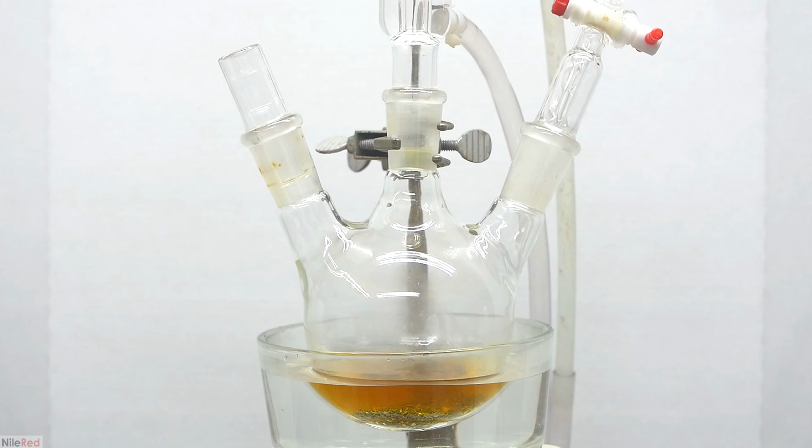Before we add any 1-bromopentane, I place the flask over a hot water bath just to heat things up. Diethyl ether has a very low boiling point, so this hot water bath causes a little bit to boil, and you can see some of the bubbles coming off. The Grignard reaction can be kind of a pain to start, especially at room temperature, so by heating things up, we're giving it a little bit of a kickstart.